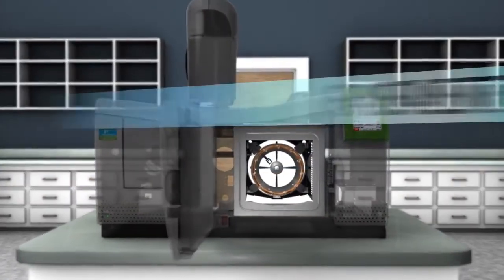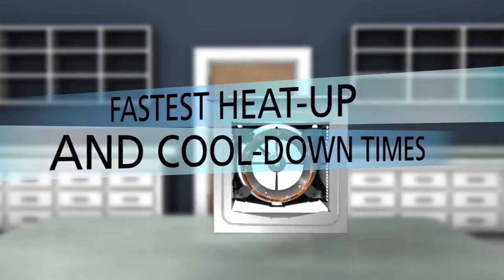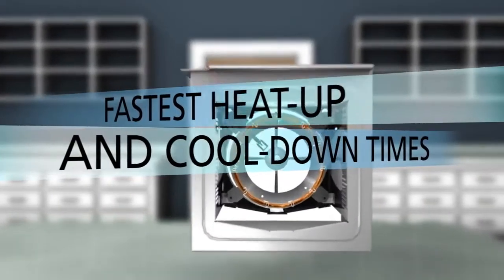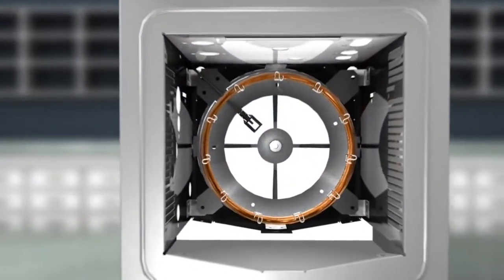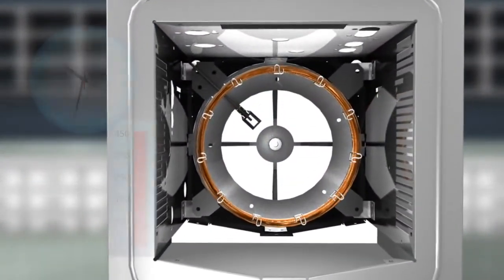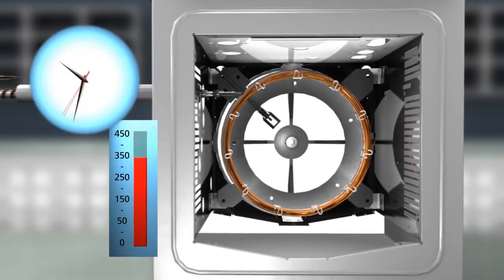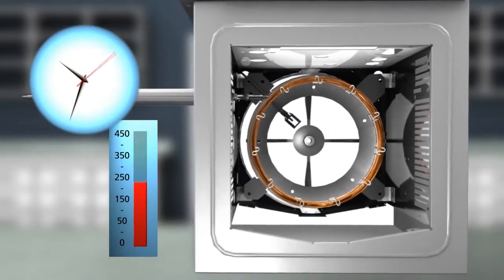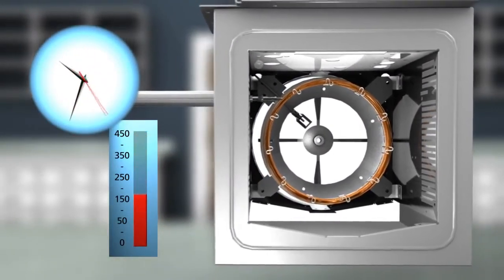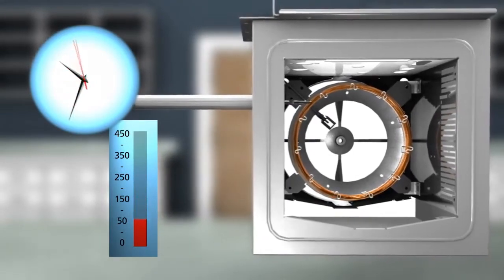Capable of the fastest heat-up and cool-down times available, the CLARIS SQ8 GC-MS Oven can drop from 450 to 50 degrees Celsius in less than two minutes, reducing time between runs for dramatically improved productivity.